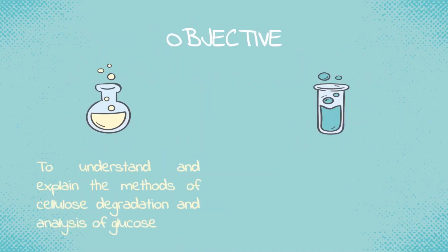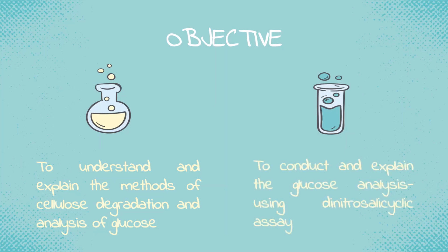Objective: to understand and explain the method of cellulose degradation and analysis of glucose, and to conduct and explain the glucose analysis using the dinitrosalicylic acid assay. Now I pass the presentation to Hui Ning.